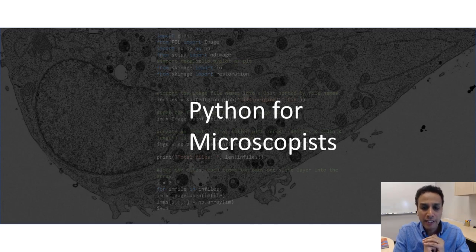In today's tutorial, let's work on a real life application, which is grain size analysis. As the name suggests, this is nothing but loading an image that has a whole bunch of grains and getting some statistics out of it. What does the grain size distribution look like? If you're a material scientist or geologist, you probably know what I'm talking about.